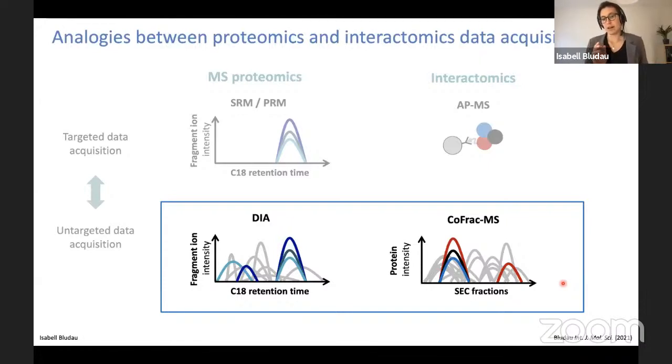These general total protein profiles actually look very similar across replicate SEC fractionations. And if something went wrong during sample preparation, then you will actually see that your total protein amount in the fractions shifts. And this is a good indication that the protein complexes actually fell apart.